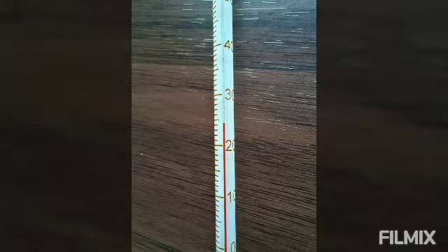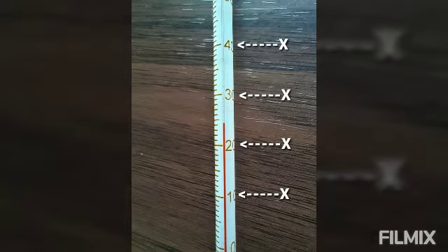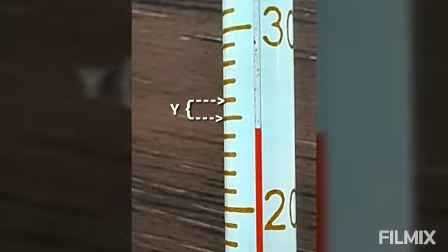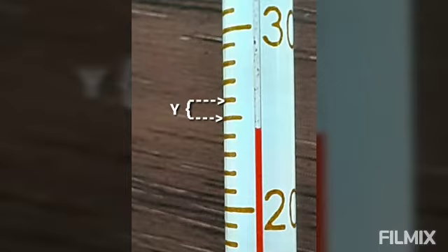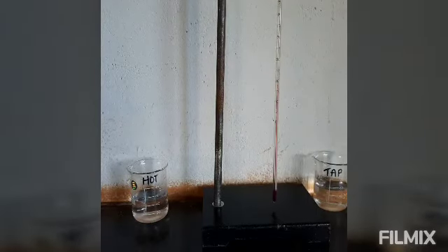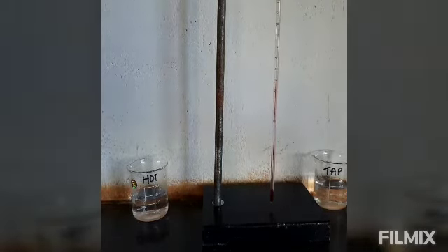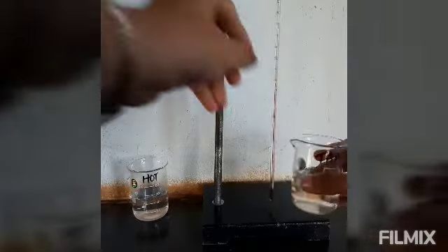Note the scale on the thermometer, which is usually the Celsius scale. Note the temperature difference between the two bigger marks on the stem of the thermometer, and note the number of smaller divisions shown by smaller marks between the two bigger marks. Procedure: dip the thermometer holding it vertically in the beaker containing tap water.